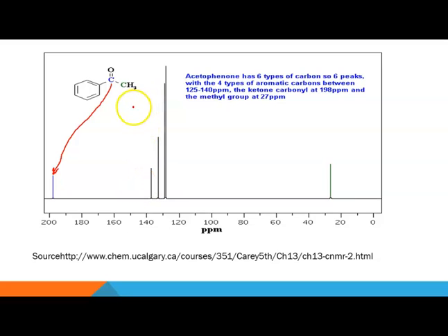All right, so this structure here is a ketone. If you remember, there's a single carbonyl group here, and then R groups or carbons on either side. And once again, we see that carbon has that double bonded oxygen. It steals the electron density from this carbon. Once you lose electron density, then you lose your magnetic field. And so now this guy is way down here, near 200. So we'll see later on what is called a shift table, that's still acceptable, and it still describes a carbon with a double bonded oxygen.